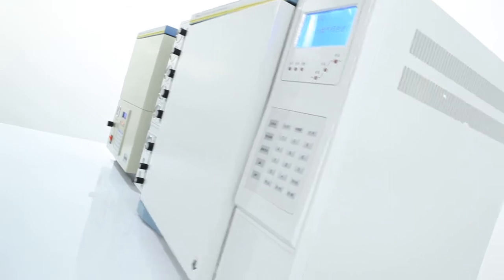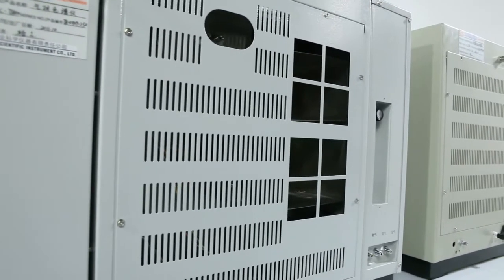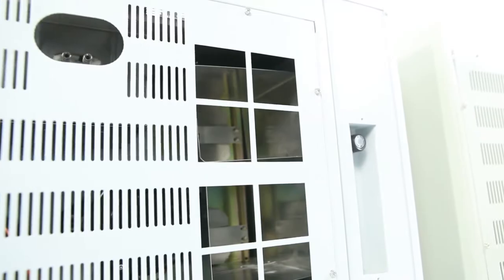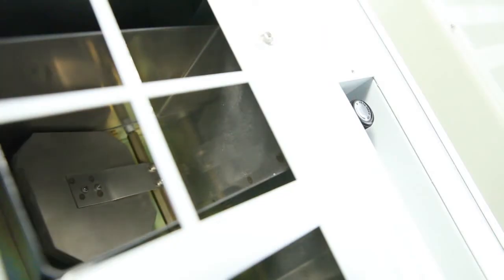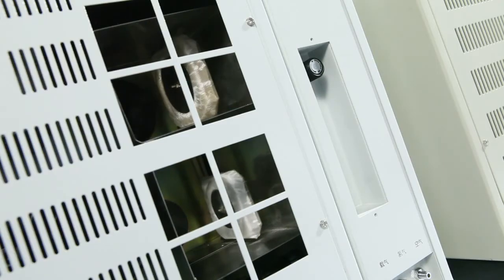The large volume oven utilizes an auto control back door, which can achieve a 250 degrees Celsius temperature reduction in only 15 minutes.